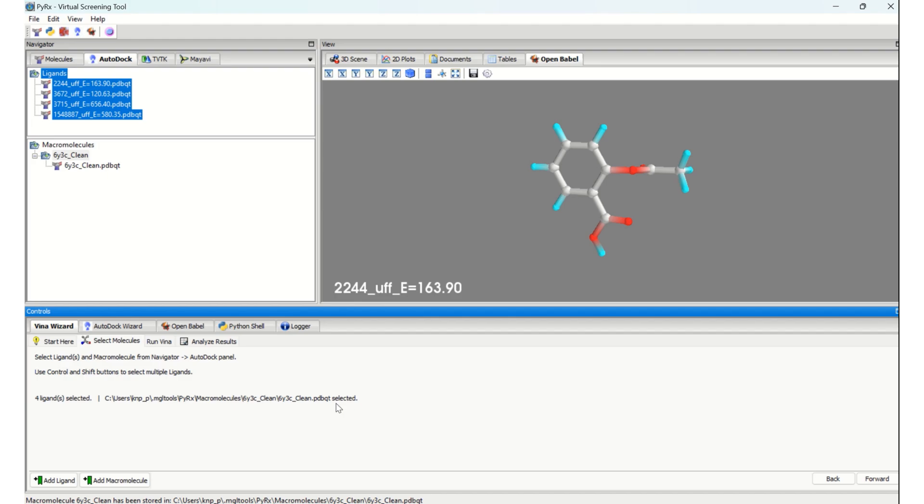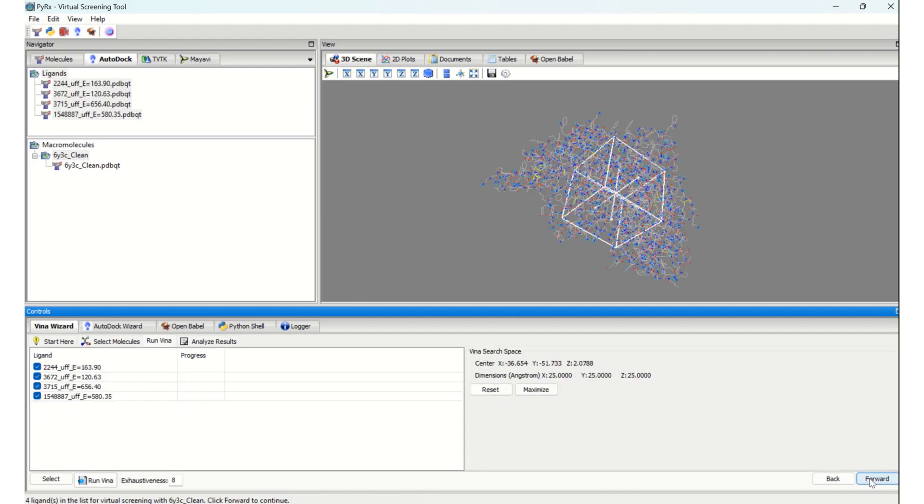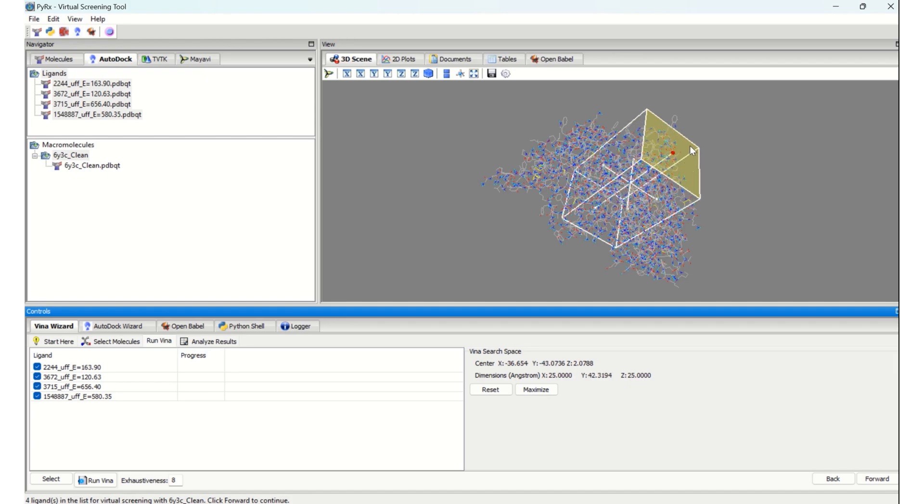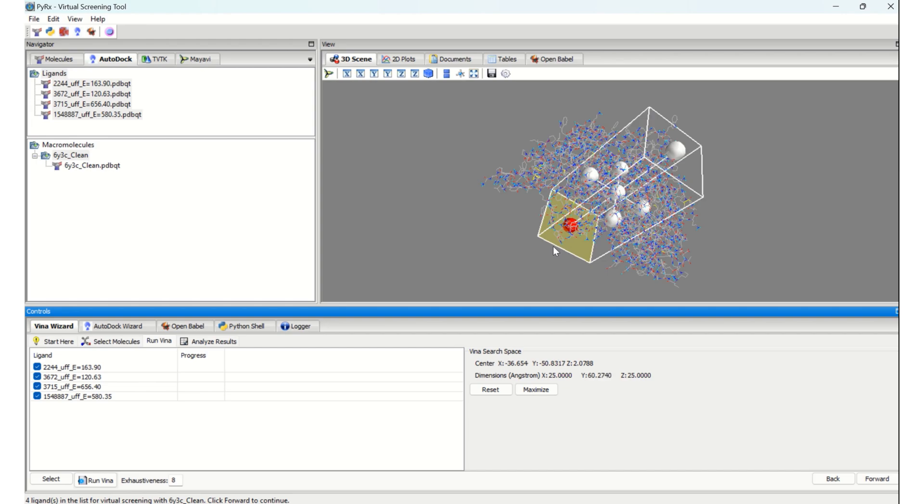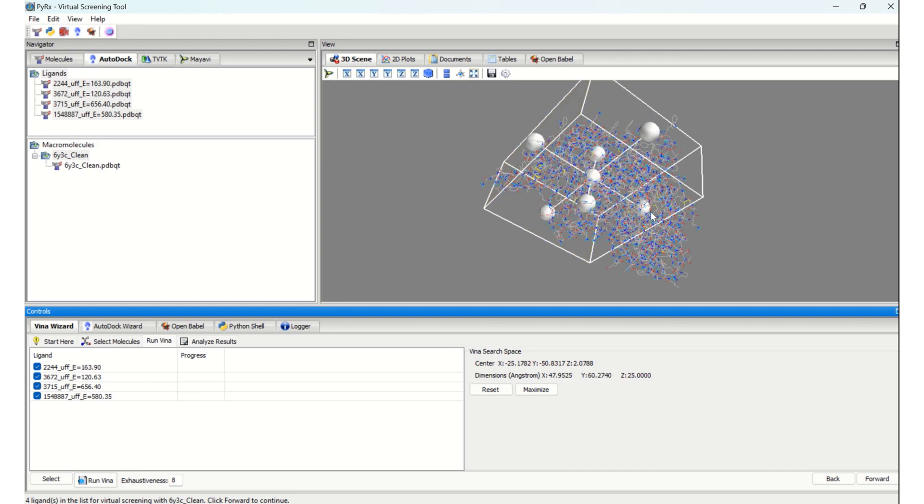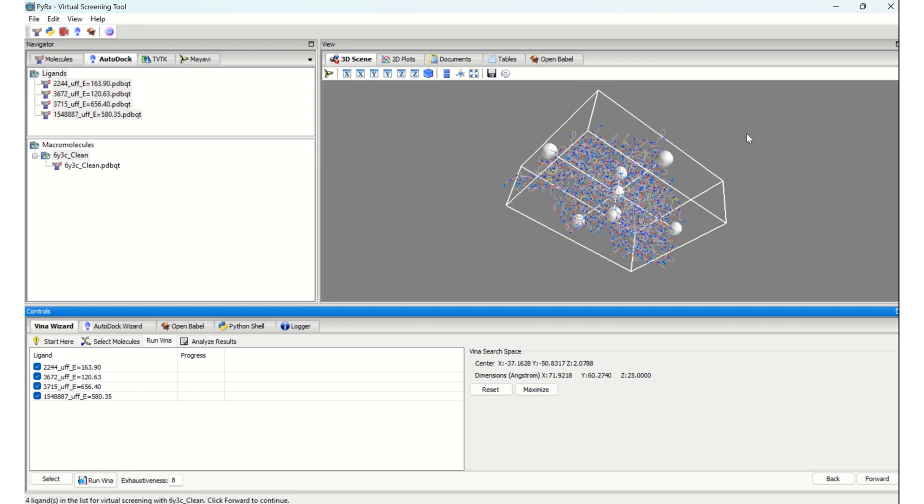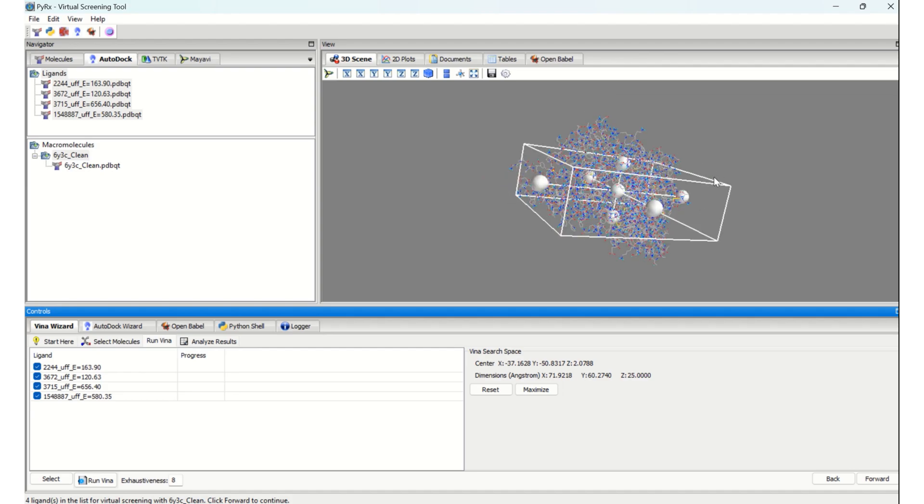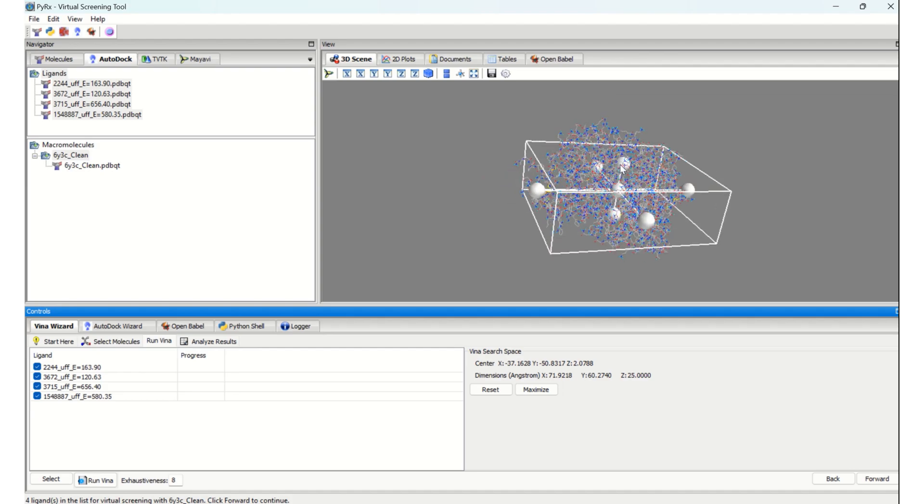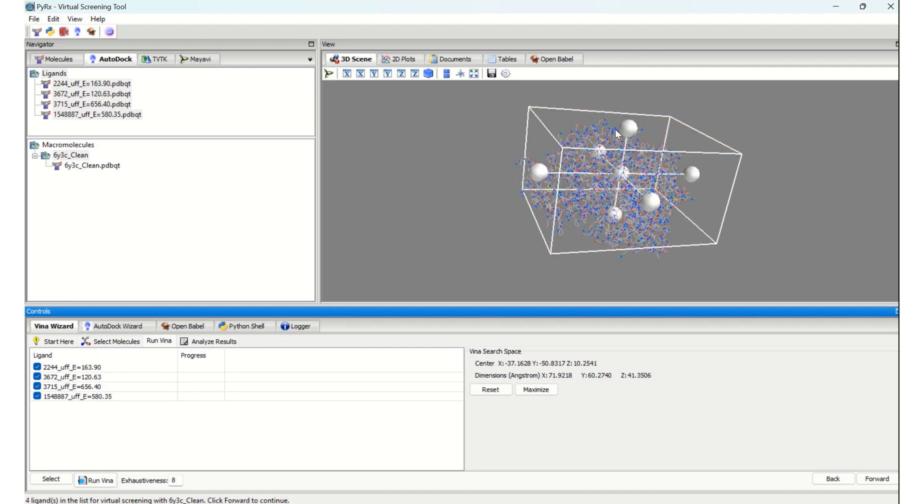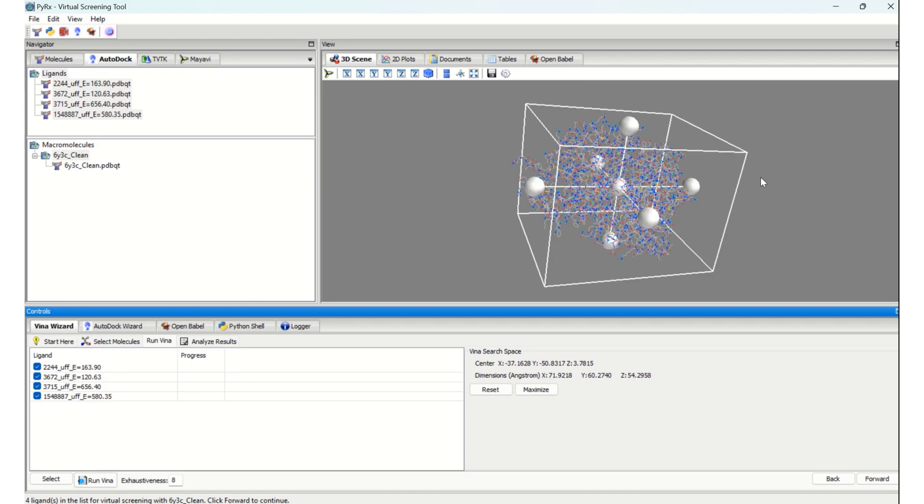This is a really crucial step. In my tutorial, I am going to show you blind docking, for which I will select the entire protein by clicking on these dots. If you are confident that your ligands are going to bind at a particular area, then you can select the grid box to that particular area.